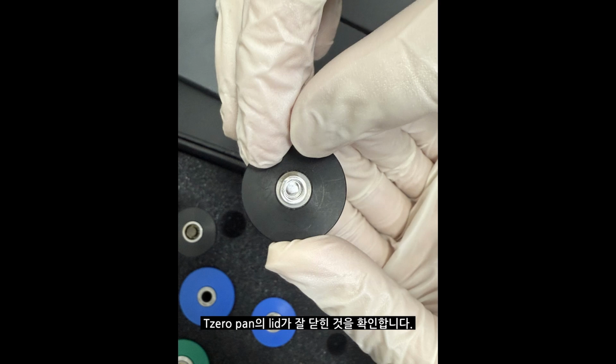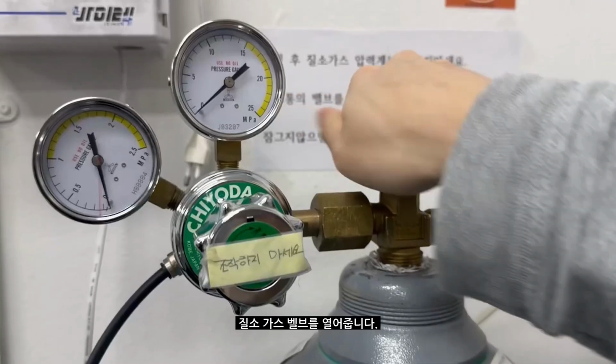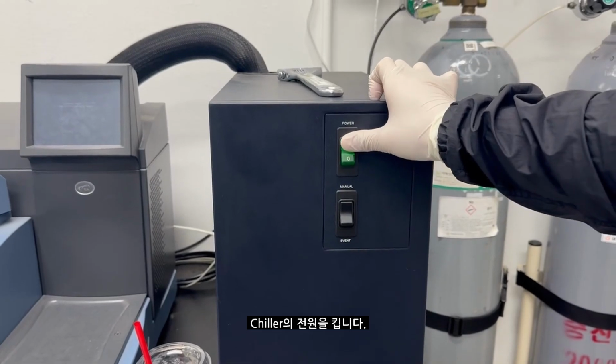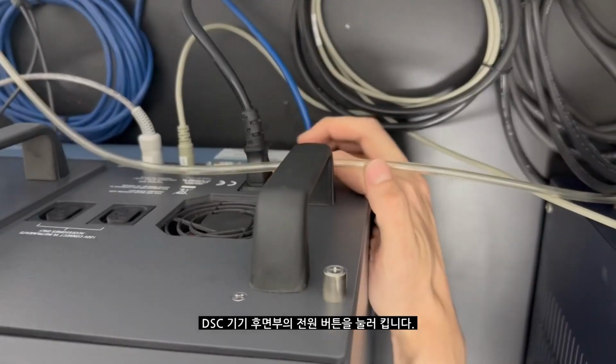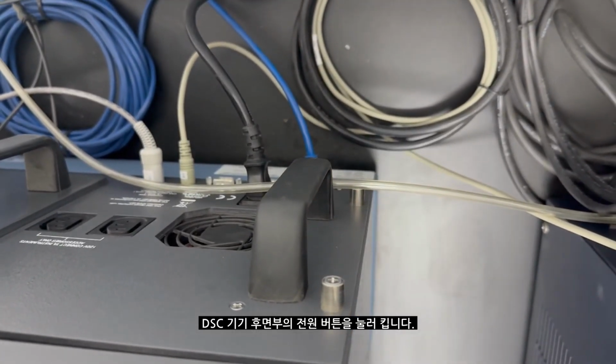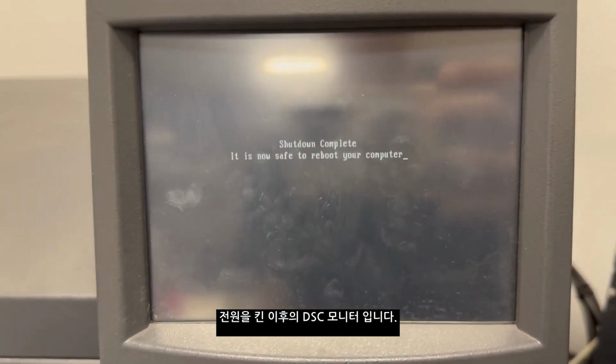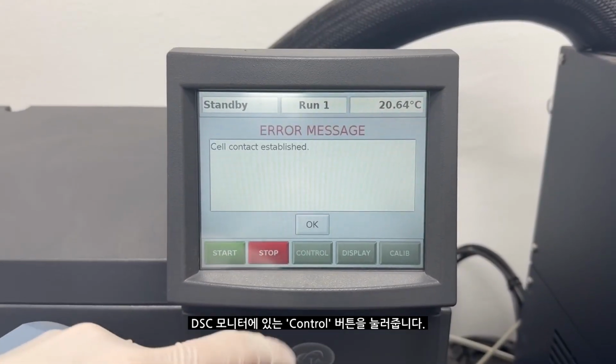Verify that the lid of the T0 pan is well closed. Open the valve of nitrogen gas. Turn on the chiller. Switch on the DSC device by pressing button. You can see the DSC monitor after turning on the device. Press the control button on the DSC monitor.